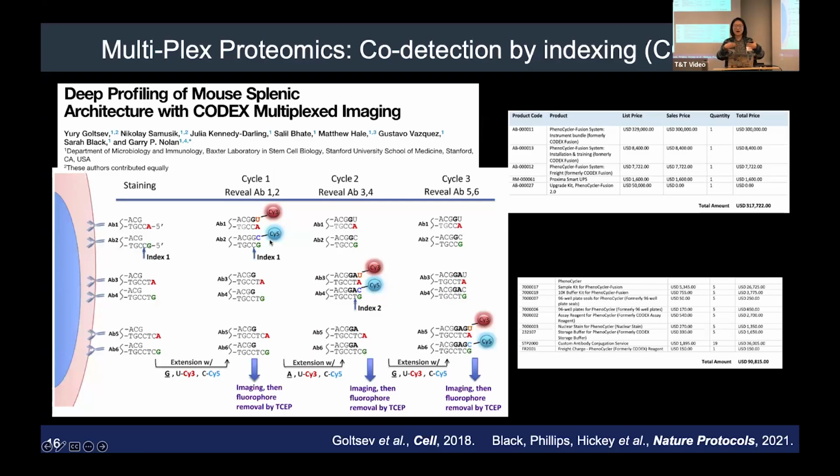And as long as it doesn't hybridize with the existing barcode and you can validate it, it can be used in conjunction with the already validated antibody. So the difficult part is how can you organize your own antibody panel for specific biology you want to study? Because each antibody might work by itself, but they might not work all at the same time. And the mission is how can you have 20 or 40 antibodies all work at the same time.